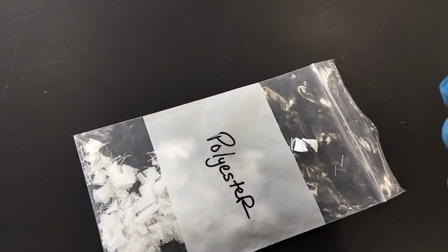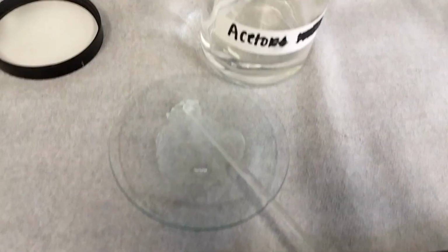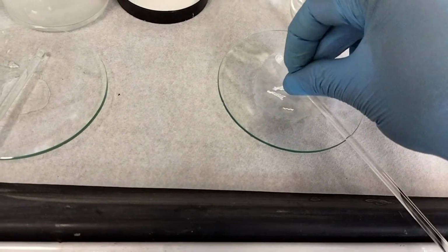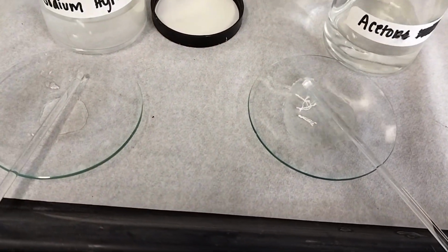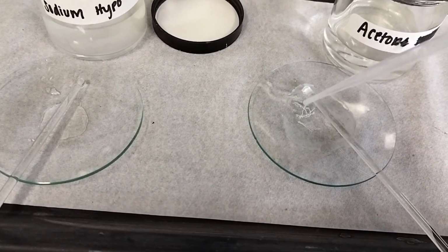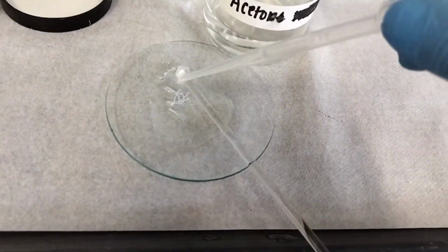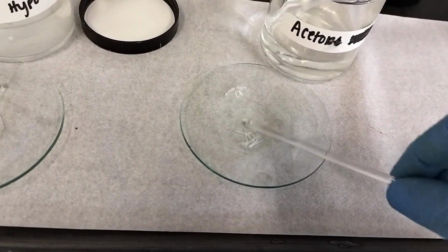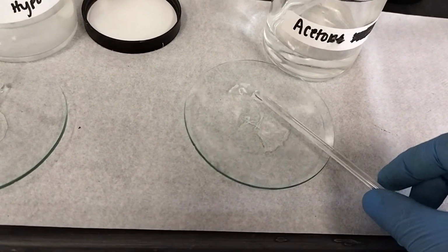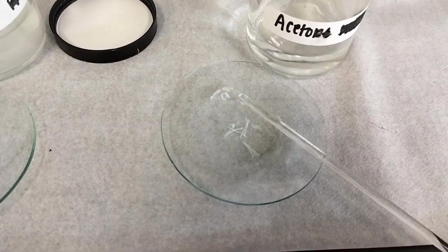Now I'm going to place this fiber sample in acetone and carefully observe the reaction. If the fiber dissolves, we can conclude that it is acetate fiber. If it does not dissolve, then we will move on to the next chemical, hydrochloric acid.